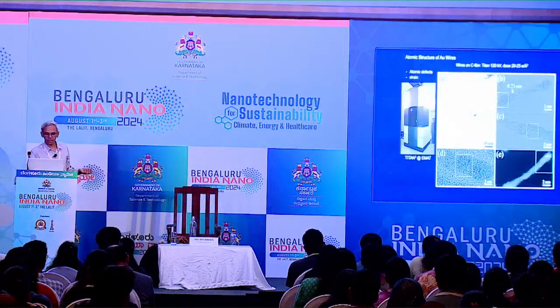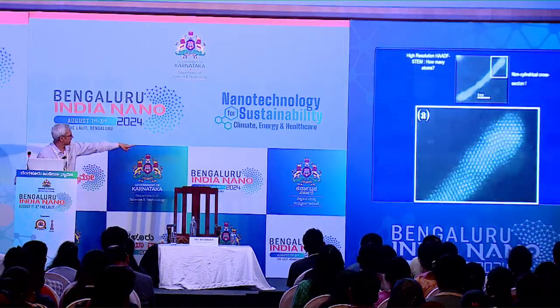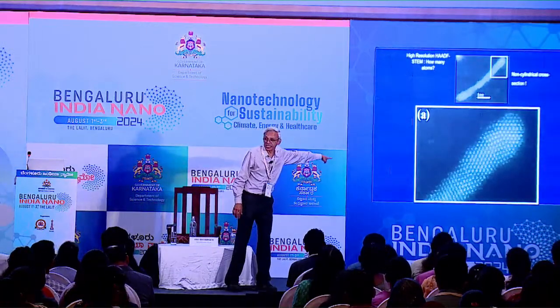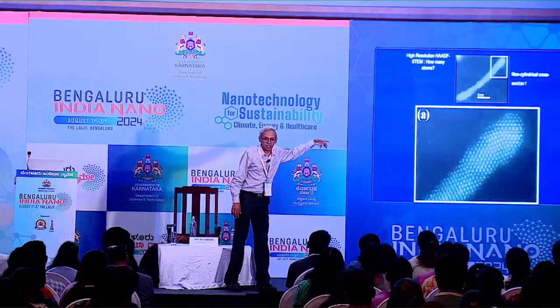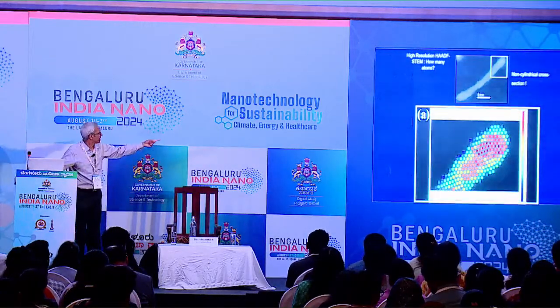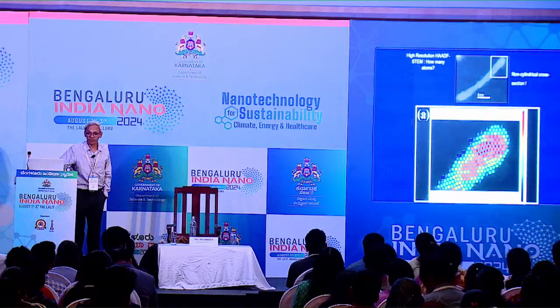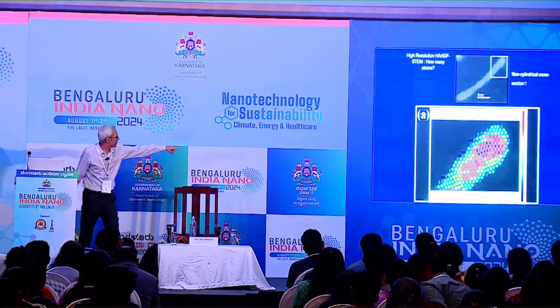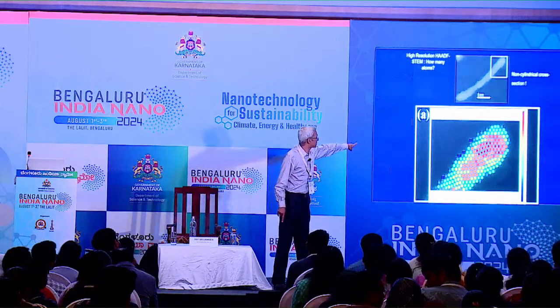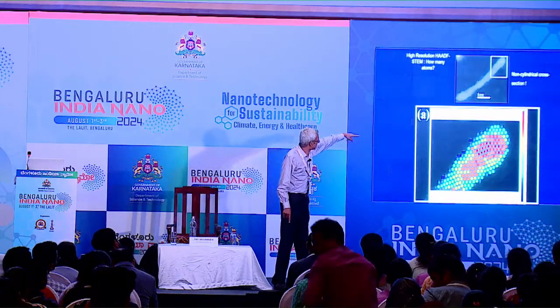First thing, this is the single nanowire. We can see that it is an FCC gold nanowire, and we can see different intensities for different columns. Using statistical analysis, we can find out the number of atoms in a given column. Okay, the numbers are too small, unfortunately you cannot read them. The dark brown means 8 atoms in the column, slightly less means 7, and so on.